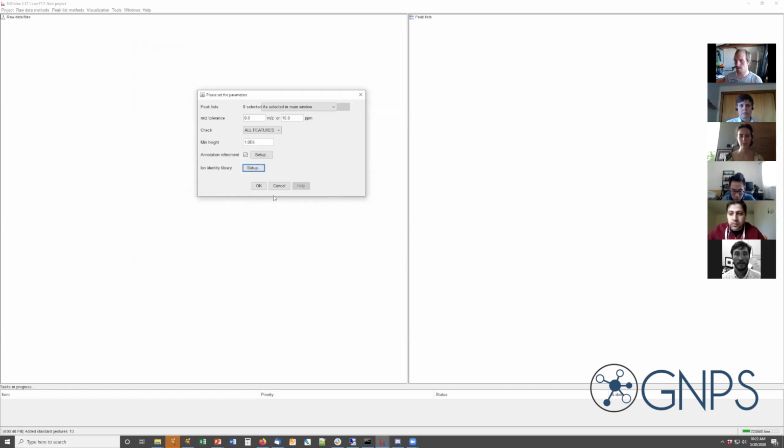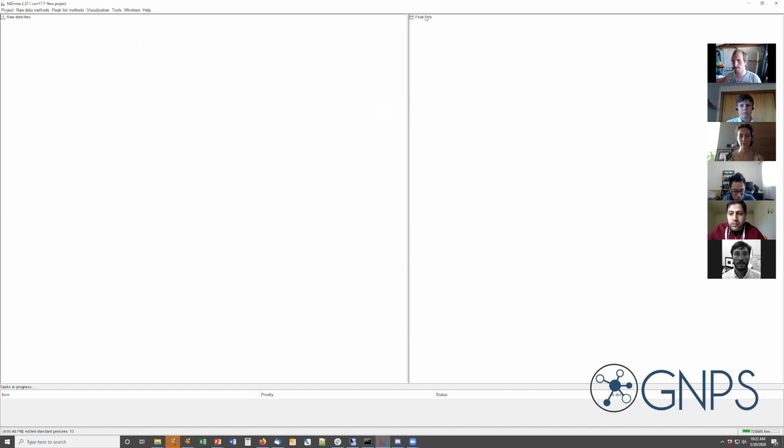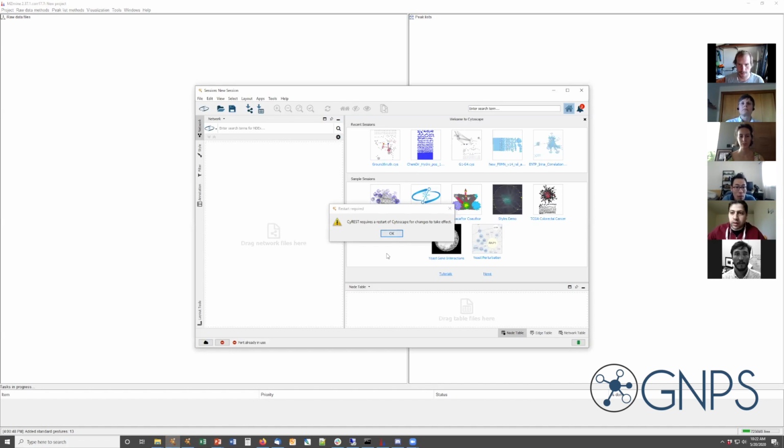Yeah. Another question: when I have two kinds of edges, would I still be able to modify the width of the edge based on the cosine score or not? Yes. Because I will have two kinds of edges, one which is dashed and one which is a solid line.